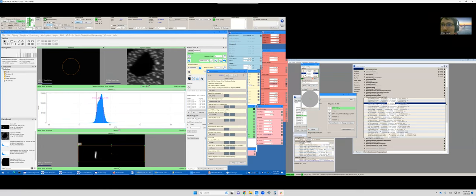So you can try to click close and click open. And you exercise this until you see a good region where it's not charging. You can observe this by looking at the peak width on the EELS detector, or you can look at the CCD camera when you put it on CCD mode. Both methods are working. You just need to keep trying to find the best position of the slit. Okay, it looks like we are entering a somewhat stable region. We're reading 10 or 11 millielectron volts full width at half maximum.